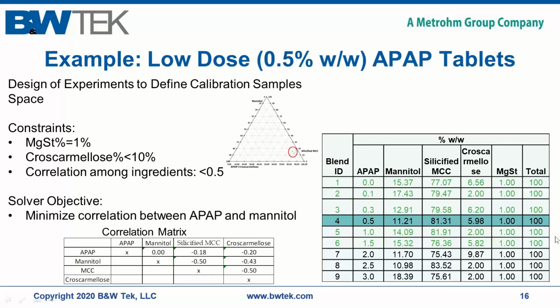Have you successfully installed the system in any pharma industry for CU analysis? This is being evaluated by numerous companies at this time, and we do have an installation at one company that has used it. Again, Transmission Raman spectroscopy itself is a well-recognized technology with growing adoption for this application.